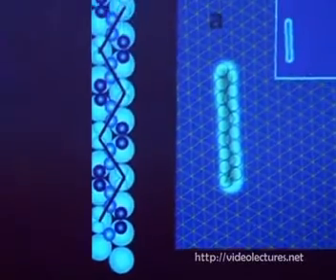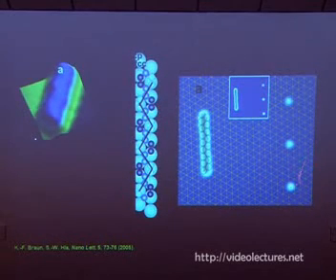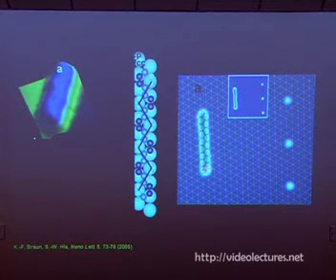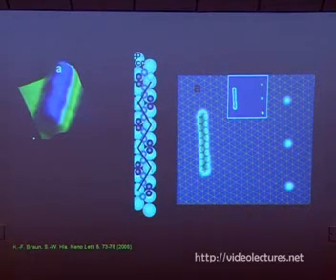Here, for example, we put the atoms exactly 6 atom distances apart. So we can now draw a net, and we know that the atoms are sitting at the 3-4 hollow sites. So we can draw this kind of net. From this, we can find the substrate atoms, which should be at the crossing points of these lines. I draw it here. So this is a molecule. These are the marker atoms. We draw the net, and we see how the atoms are sitting. From this, now I can draw up the model, which is from measurement.